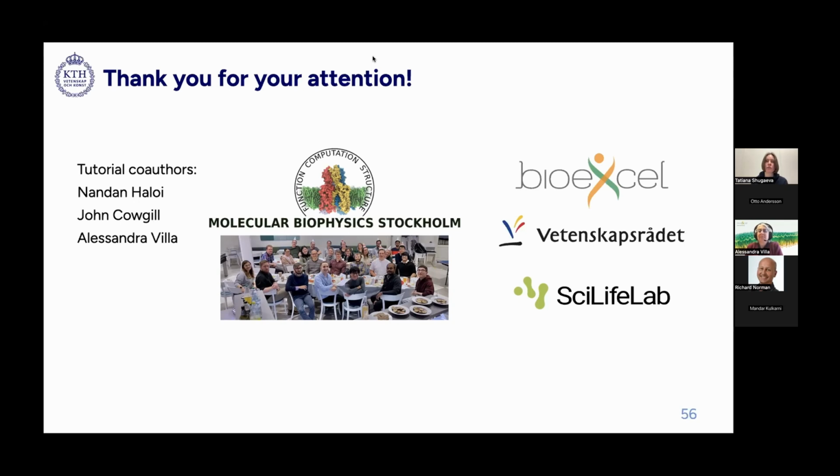And also regarding pH, when you do your simulation setup, you can pick different protonations for your atoms, depending on what pH you want to use. And if you want to know a bit more about this, in GROMACS we have also recently added the constant pH algorithm that you can look into if you want some more fine tuning for pH in your system. Thank you. And we go further now.